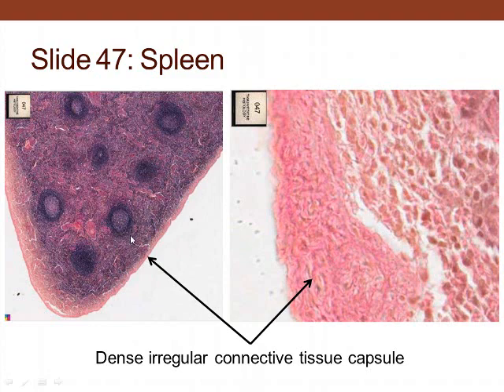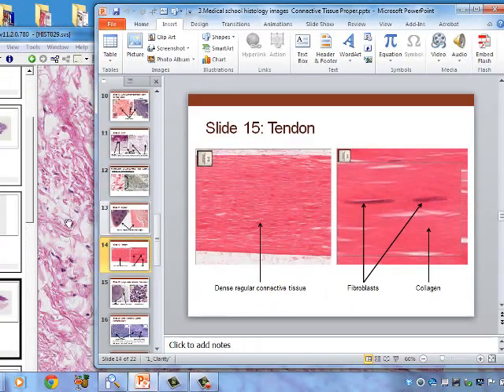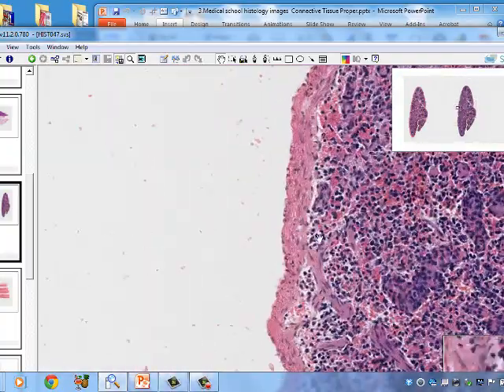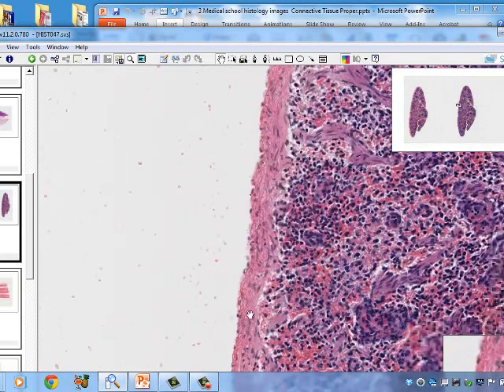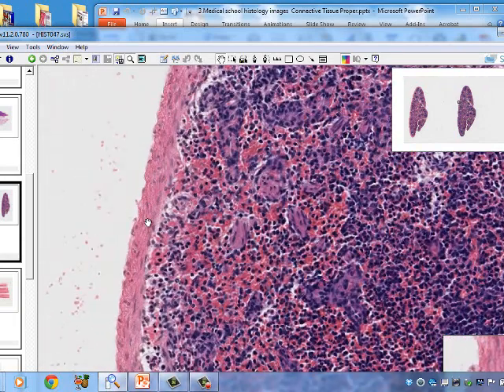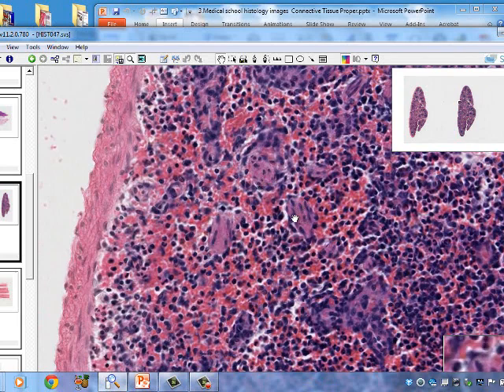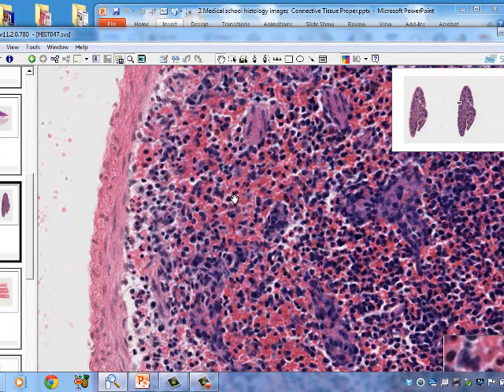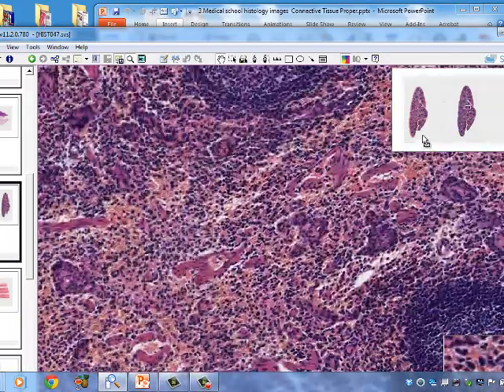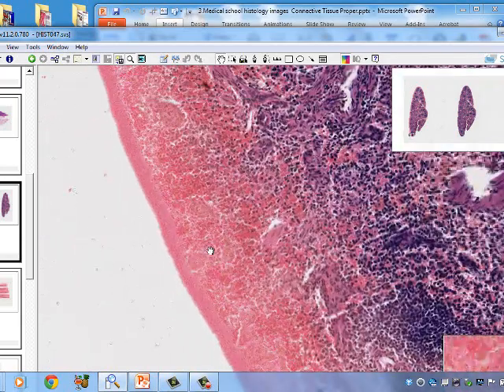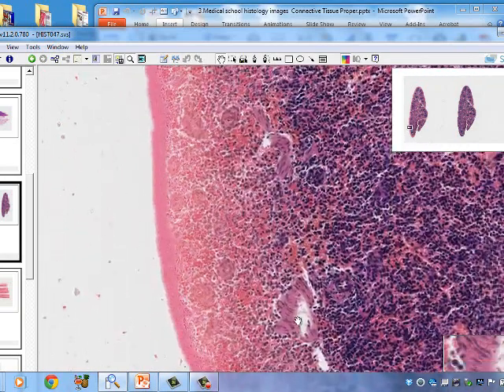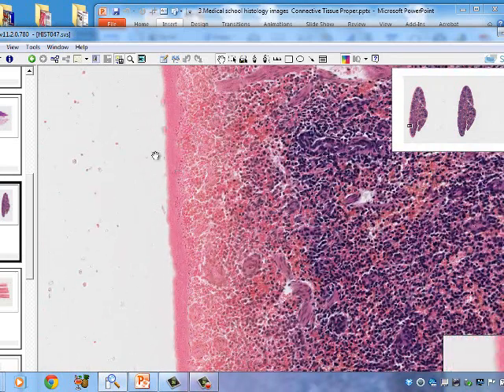Taking a look at the spleen, we can see the capsule on the outside, which is dense irregular connective tissue. Sometimes there is a thin mesothelium on the very top of the capsule. Inside is lymphoid tissue, smooth muscle, and red blood cells as well as neutrophils. The capsule projects inward, and any blood vessels present must be supported by connective tissue.